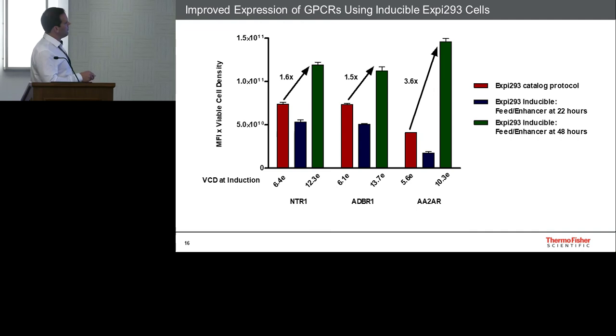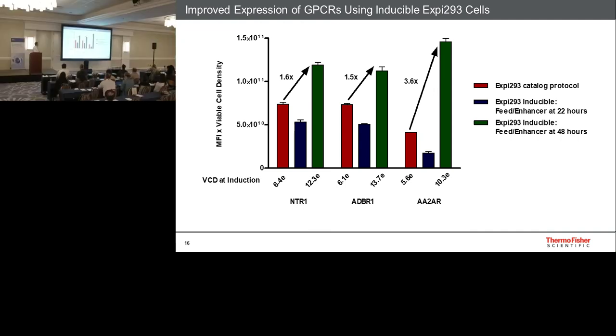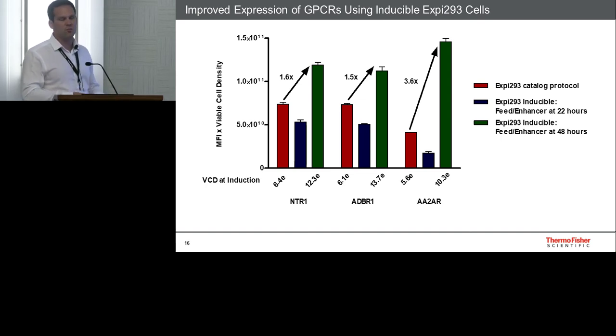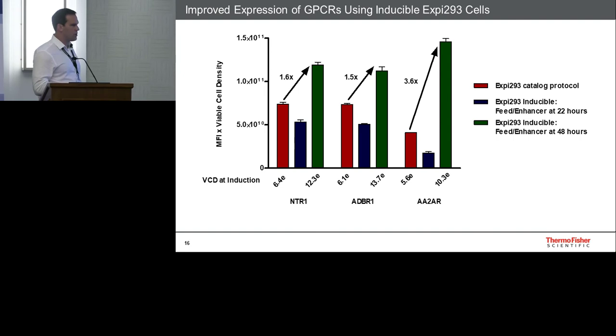So certainly some of this improvement in expression is based simply on biomass, but in terms of membrane proteins that are expressing in very low concentrations, the more biomass you can have in a small volume, the more cost-effective your reactions are. And just to give you an example for some of these GPCRs, CB2 that we've done work for, we've typically had what are considered to be very good titers in the structural biology community, somewhere in the 3 to 4 mg per liter purified range. So we're getting quite good expression levels with some of these clones in the system.